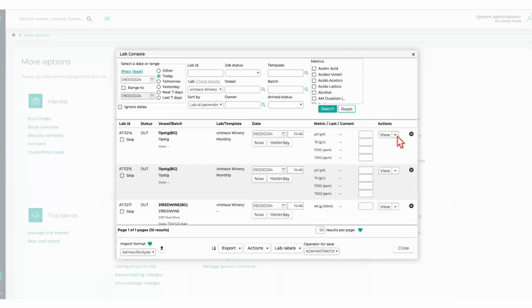After that, you will need to go through, and this is for ETS as well, and either update or confirm. If you don't do that and you close out, all of your results will just disappear and you'll have to do this upload again. If you would like, down here at the bottom, you can update or confirm by full page, which is kind of nice to save some time. And yeah, so that's pretty much how you would do it for any in-lab or in-house lab equipment.